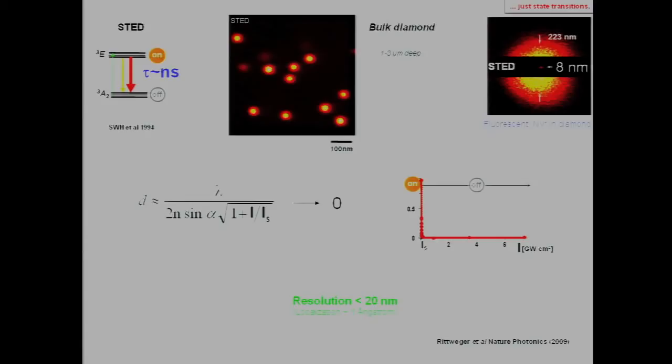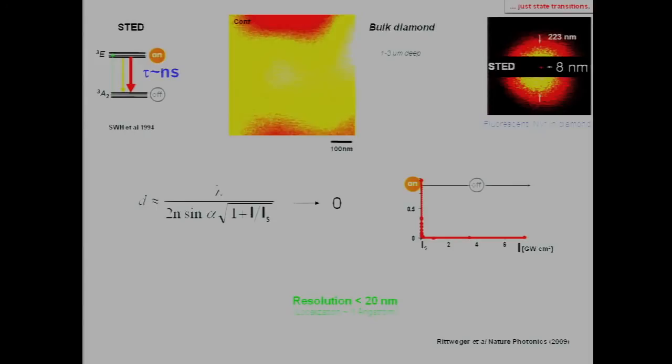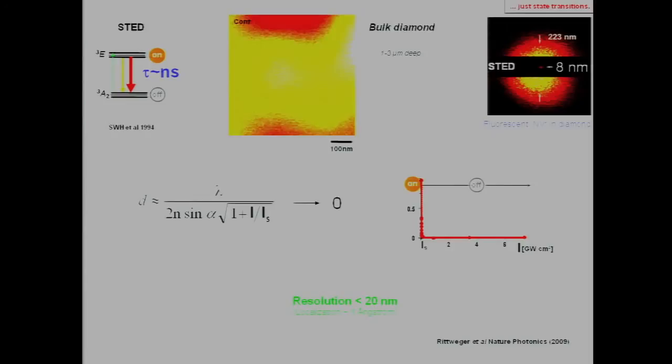And so this has been done here, and because this is so bright, this went down to about 1 to 2 angstroms. And you know now, from high school, 1 to 2 angstroms, this is about the size of an atom. Now, at the risk of sounding perhaps dramatic or too dramatic, here you see nothing, nothing. No way to find out anything. Here, you see each individual defect, this molecular-like system, with the precision of the size of an atom, with a regular objective lens and focused visible light. In fact, the wavelength here was 770 nanometers, so near infrared. It tells you something has happened. But while you may be impressed by this, a word of caution.